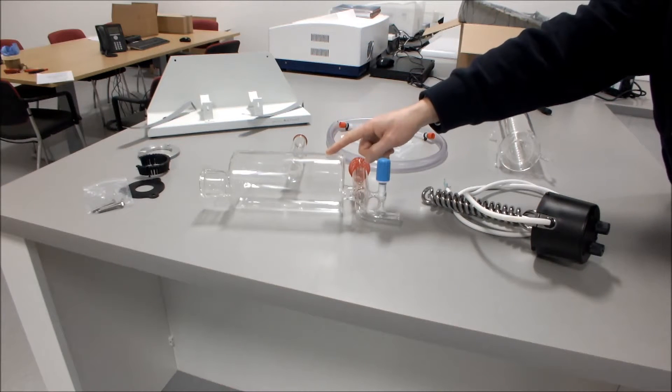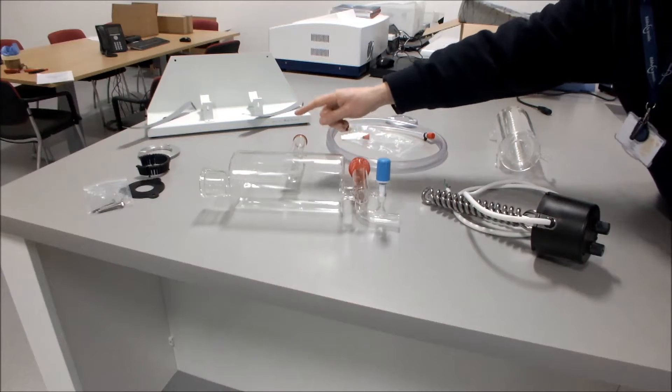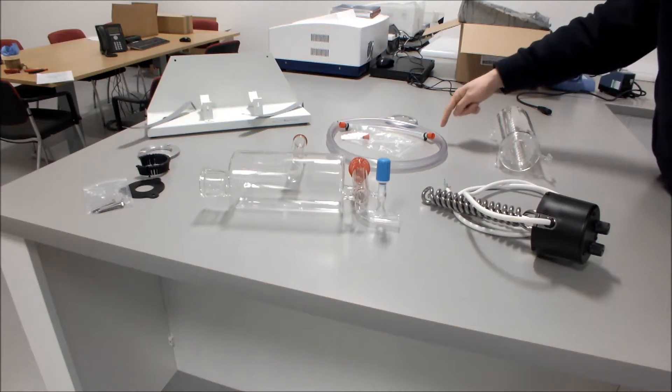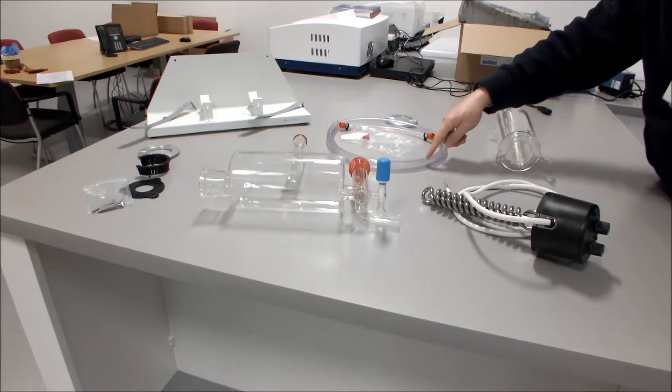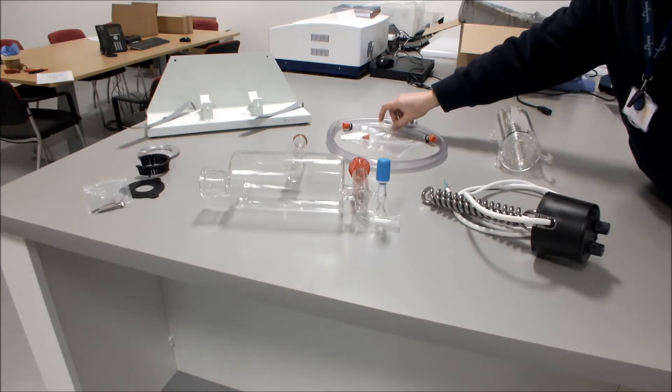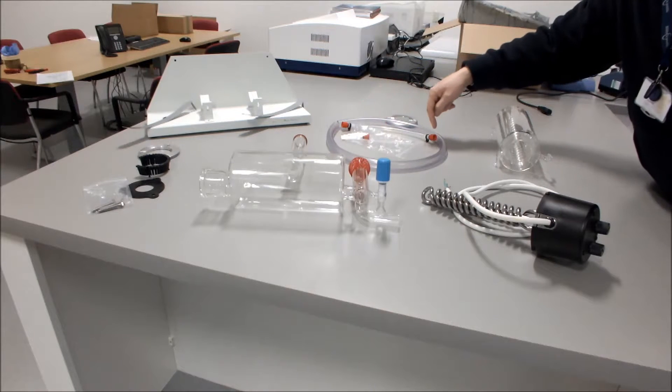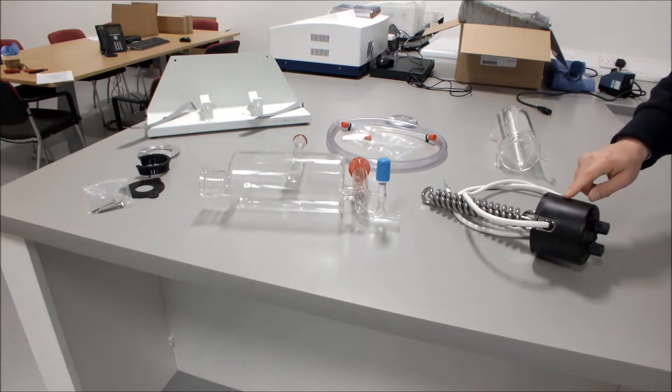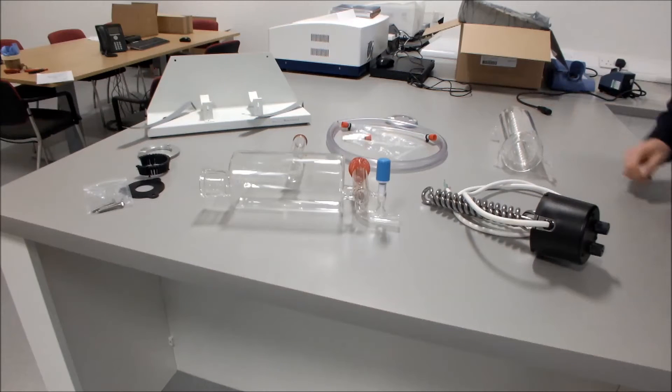You should have the boiler complete with the sealing o-ring, stabilizing o-ring, and stopcock. You should have the hose kit with a 1 meter length of 16mm hose, an 8mm hose with two connectors on the end, two tie wraps and spare connector. You should have the heater and the condenser.